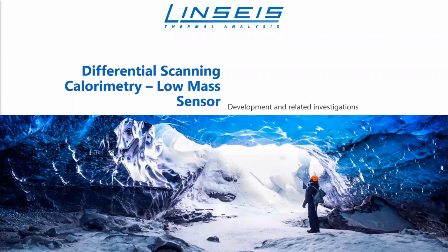Today we want to talk about DSC, especially our chip DSC system with our new low mass sensor. This year I already held a lecture regarding our extended sensor, and now there's a third option for our measurement systems for the chip DSC.